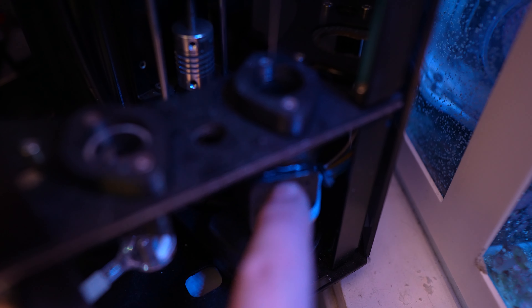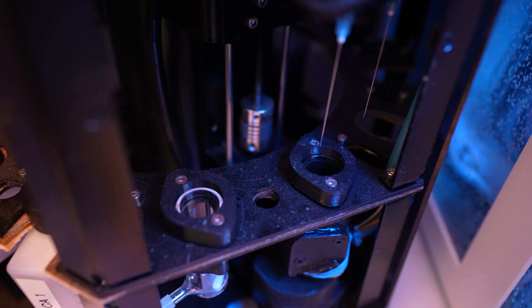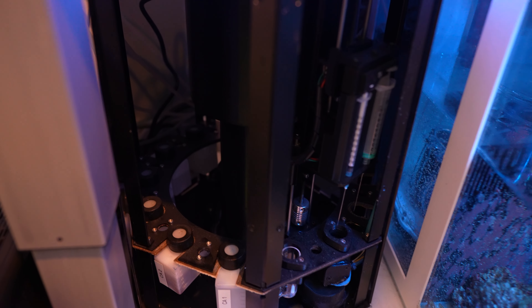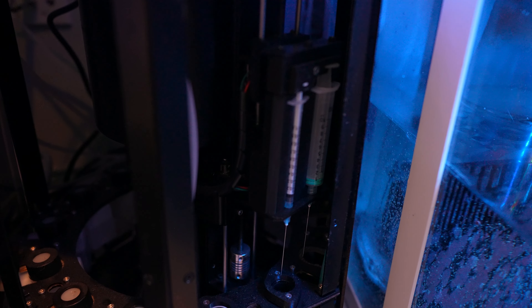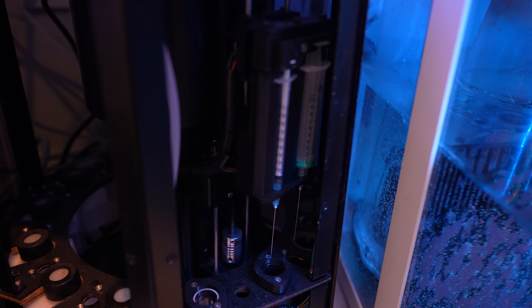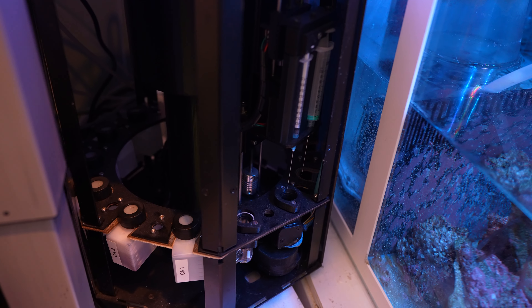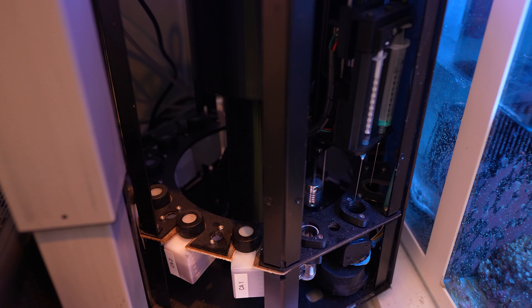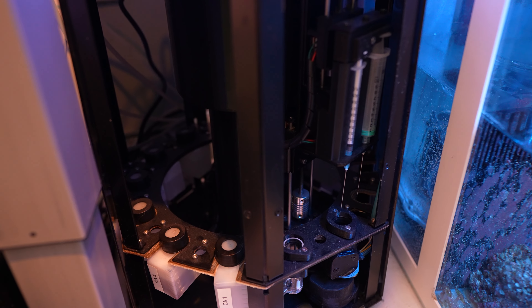Inside there's a little colorimeter that does a test as it goes — it flashes a light after every drop and figures out what the color is, basically automating your manual test kit. A big question people always ask is how accurate it is. Overall, I'd say it's pretty accurate, but even if calibration is slightly off, it doesn't overly matter. The biggest thing is that it's consistent — a robot doing the exact same test the exact same way every single week. You'll see your trends and how they're changing. With manual testing, human error means your results sway more because there's no consistency.